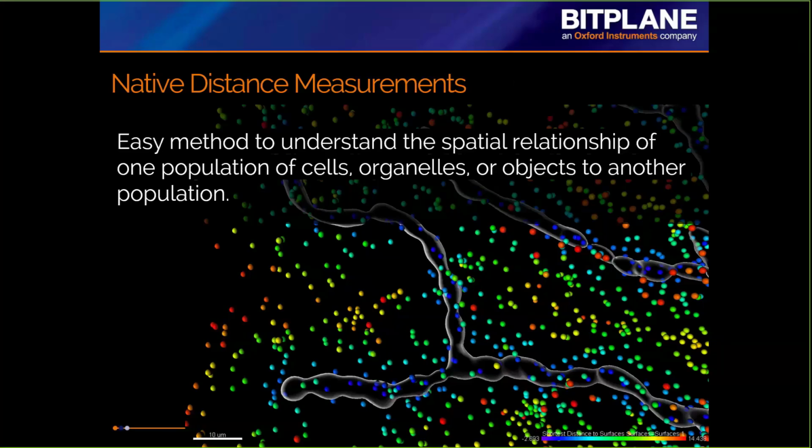We've seen that this is an application that many of our users want to do, but it was cumbersome. We found it cumbersome, and we believe our users found it cumbersome as well. And so we wanted to make these measurements and this assay as easy as possible for you.